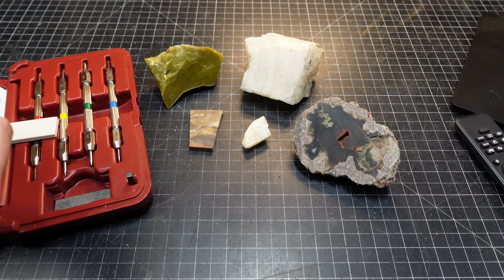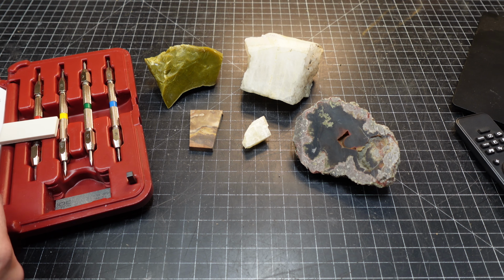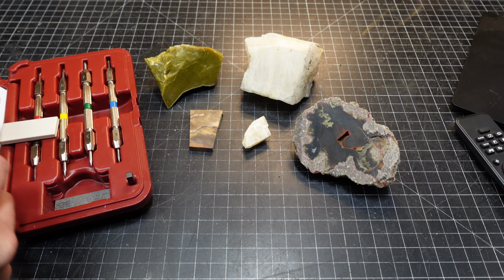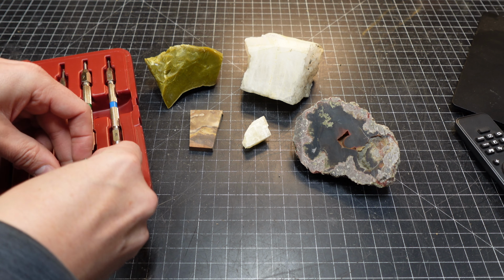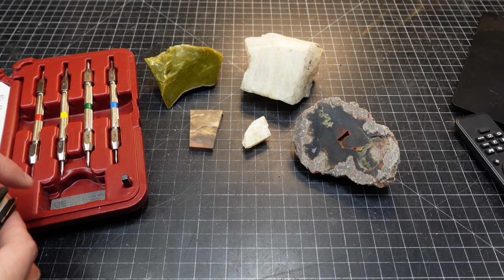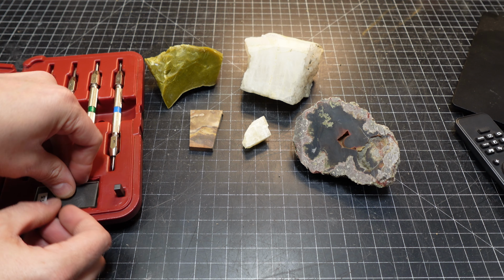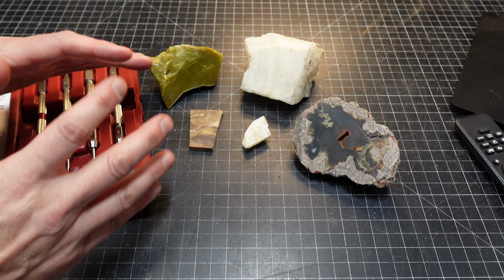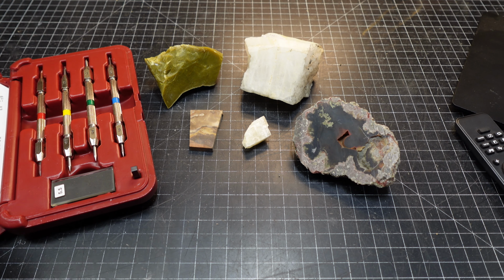One thing that it's important to point out here is this is just one step among many that you're going to want to do to really identify something. Like I said before, specific gravity, there's all these other things, the fracture. We're only looking at hardness today.